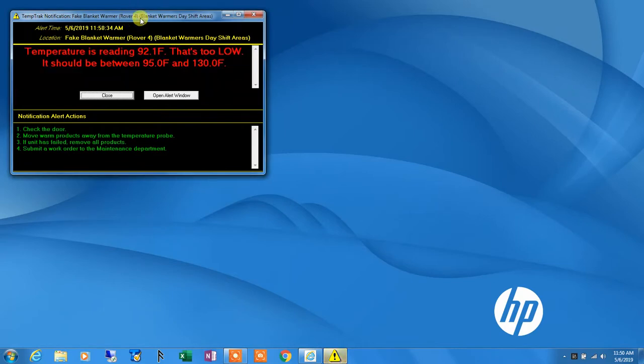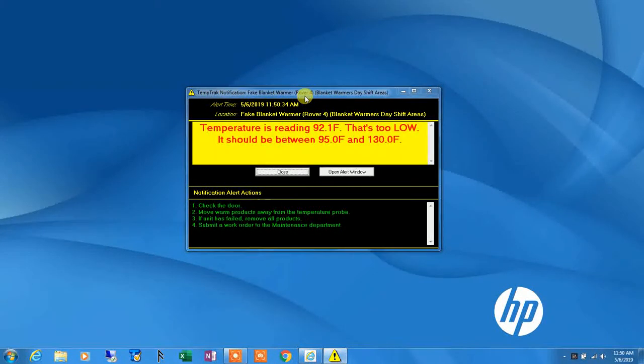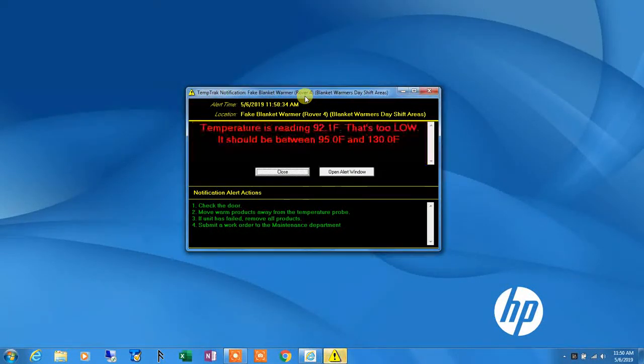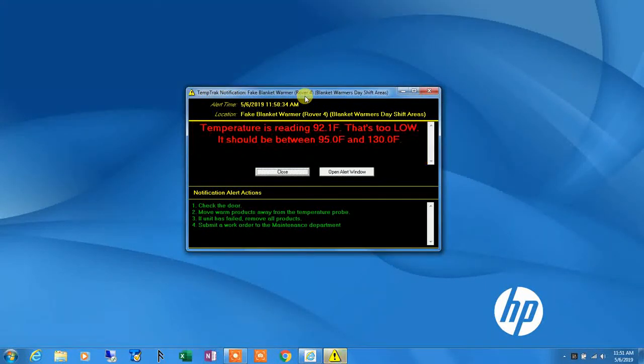And this is normally what you'll see on your display when a pop-up alert takes place. That audible sound that you heard, if you have speakers connected to your computer, is the sound you'll hear when a pop-up message alert arrives. That sound will probably repeat itself and become very annoying very quickly. I have my sound set up to not loop, so it's enough to get your attention if you're in the area, but it will not annoy you.